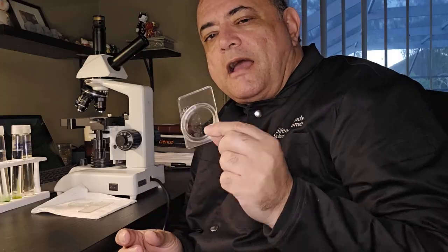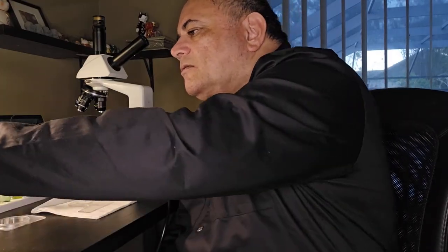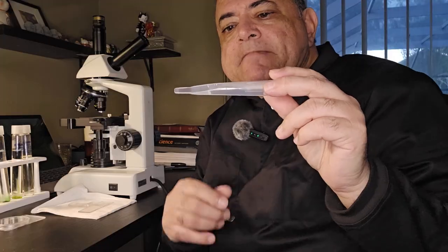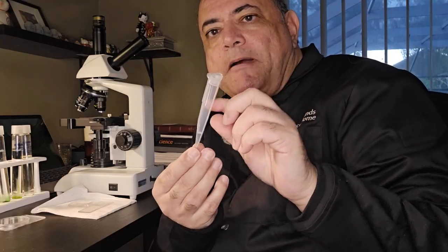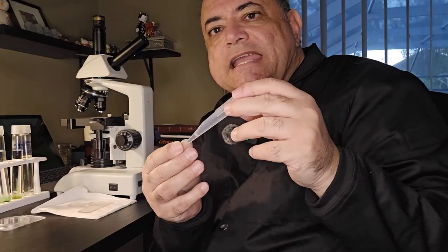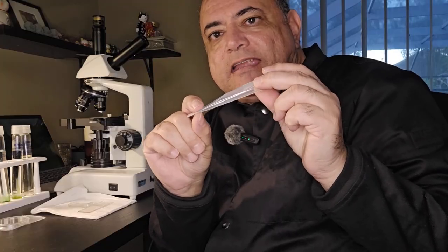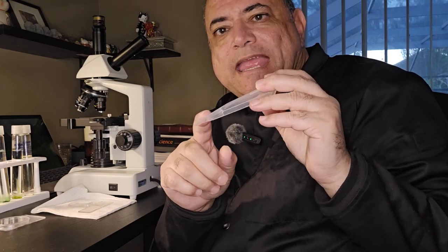So I first like to examine microorganisms either in a Petri slide or what we call a demi slide. These are demi slides, and basically, again, you pipette your culture into the demi slide, and you have a very thin tip, which is the viewing area.